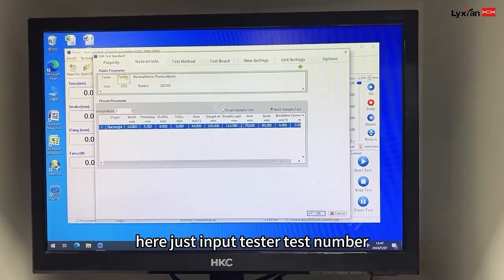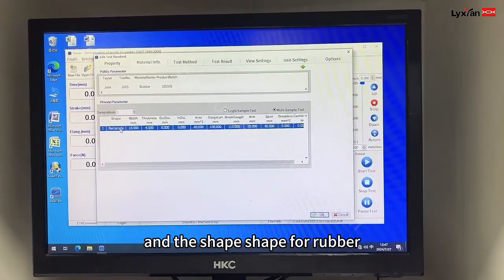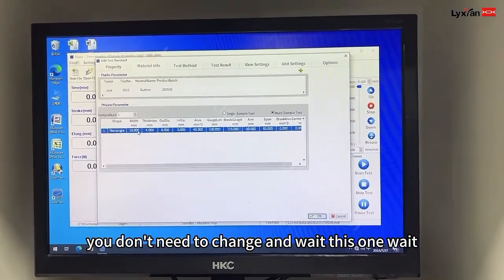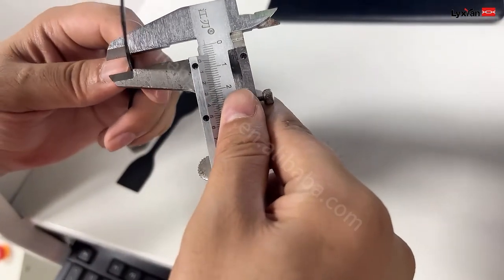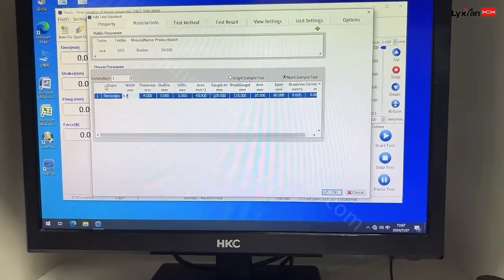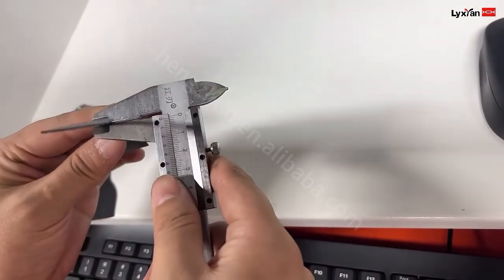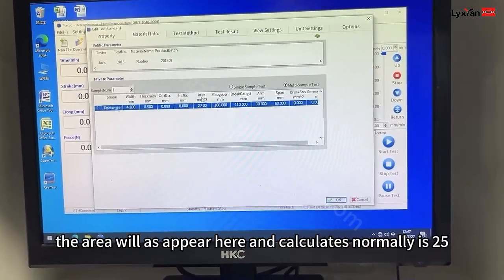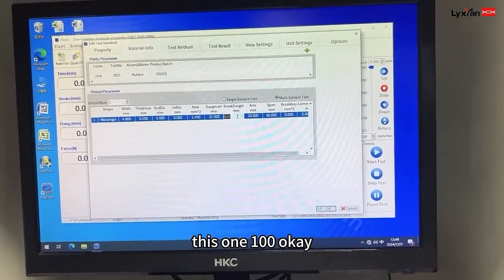And the second part: just input tester, test number, material — rubber, product number, series. And the shape — for rubber, we choose rectangle. Another one you don't need to change. And weight — this one, weight: 4.3. Thickness: this went to 5. And now the error will disappear. And the gauge is normally 35. This one: 100.